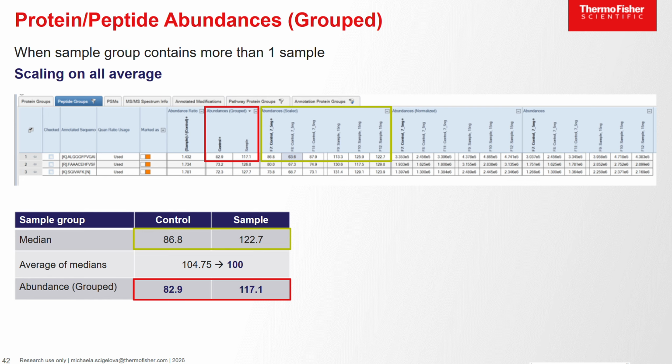Looking at the green box here, I have sample experiment A versus B type. I have 3 replicas of each, control and sample, as you see here. And I would expect that the median value has been selected to represent the group of the 3 replicas.